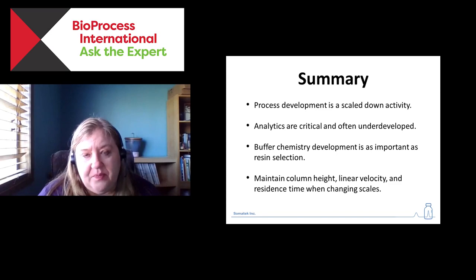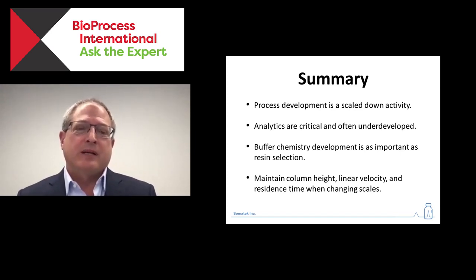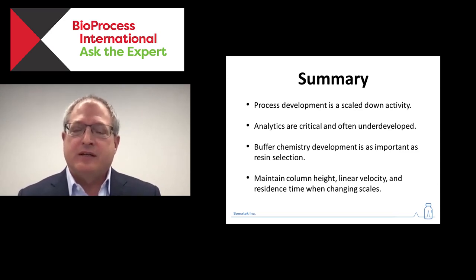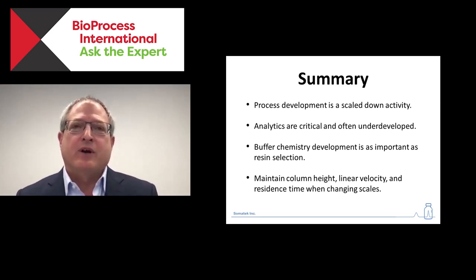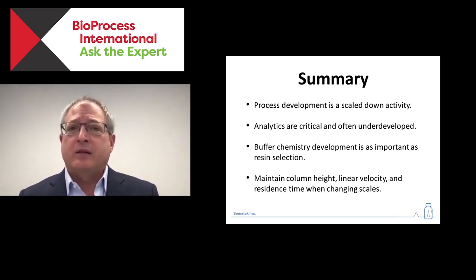Yes. Most virus-like particles, retro included, the type of resin that does most of the heavy lifting is usually an anion exchange column. Obviously, from this talk you can see which one we liked for this project. The Bio-Rad Nuvia Q, we got really amazing results at a very high flow rate. But in general, there's a lot of products on the market, and I would look at several of them.